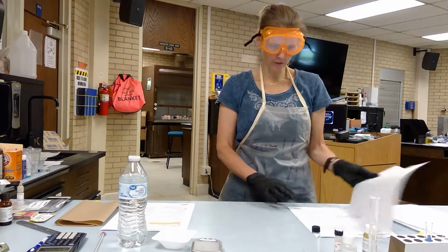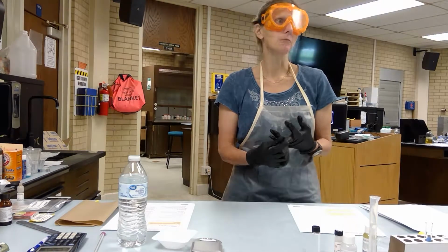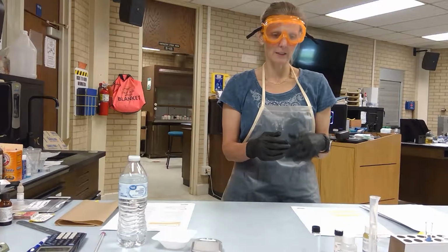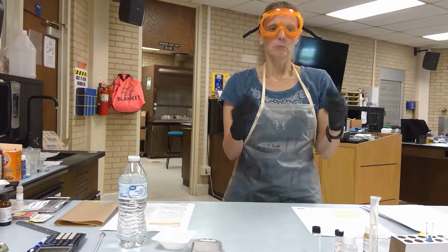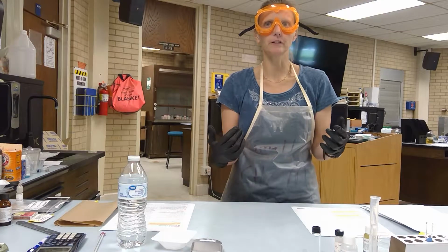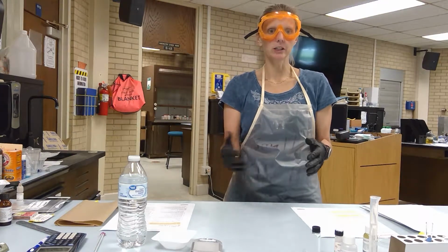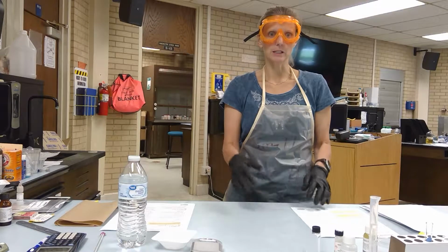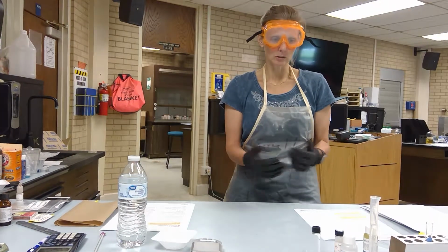And so in the end, you end up testing for approximately 4 different things. You'll test for pH, you'll test for density, you'll test for triglycerides. I'm sure we've all heard of triglycerides. And then you will also test for unreacted triglycerides, and that is one of the things that we're testing for in terms of quality. And we often talk about perfect labs, that students often think that teachers expect perfect labs to occur, and that doesn't always happen. And so that's one of the things that you're going to look at to see whether or not the lab went to complete formation of your transesterification. So the final test is quality and the presence of unreacted triglycerides.